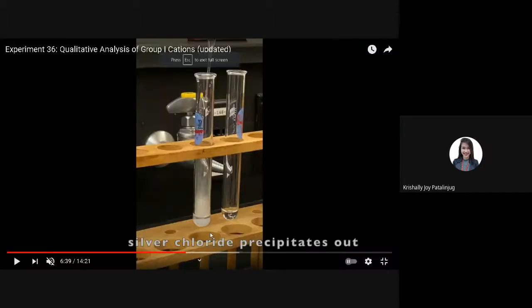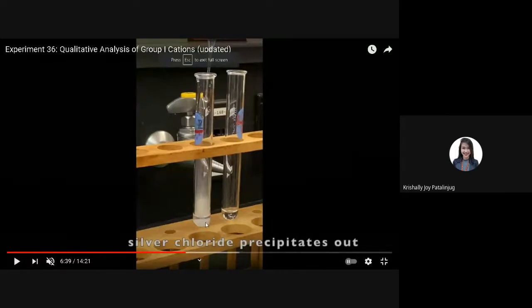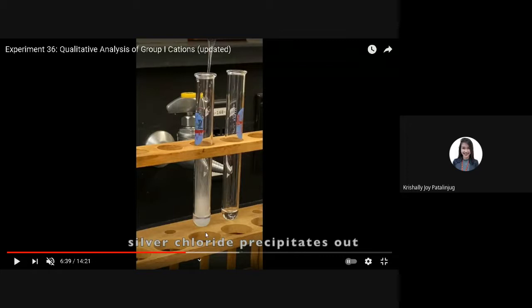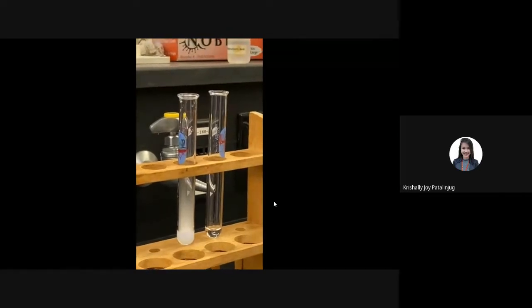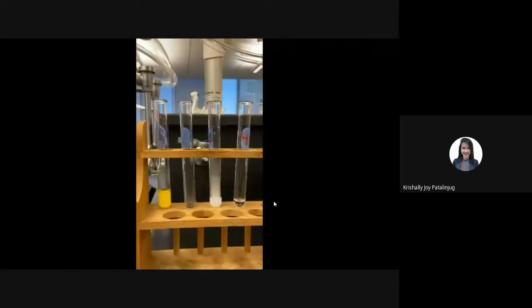Okay, observe, upon adding nitric acid to the supernatant with silver ion, you can see there is white turbidity being observed. That is the silver chloride. Recall, silver chloride is a white precipitate. Okay, so confirm na silver talaga yung andyan using nitric acid. Nakuha? So that's the identification method.